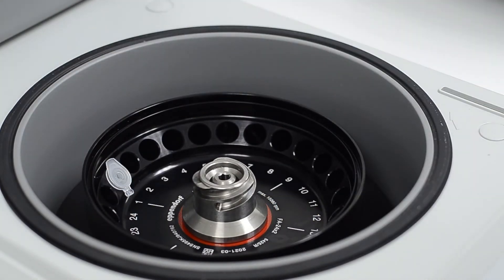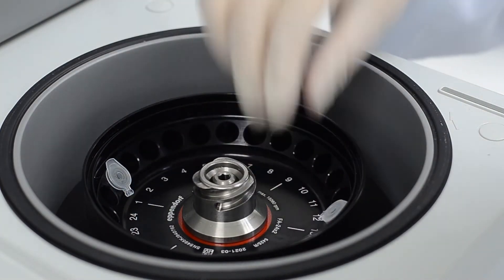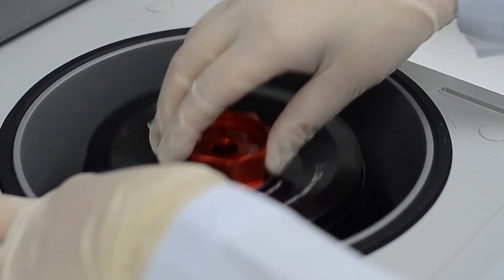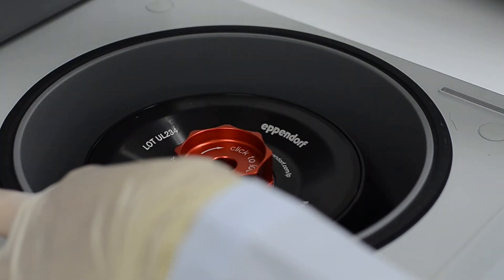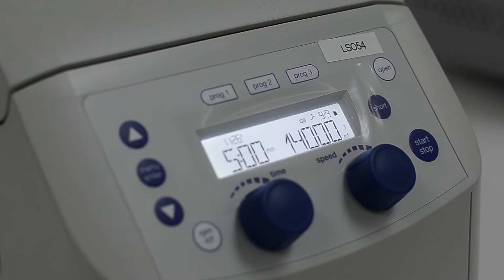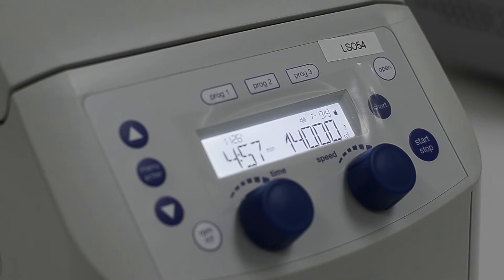Transfer the tube to a centrifuge machine. Centrifuge the mixture at 14,000 G for 5 minutes to spin down the precipitate.